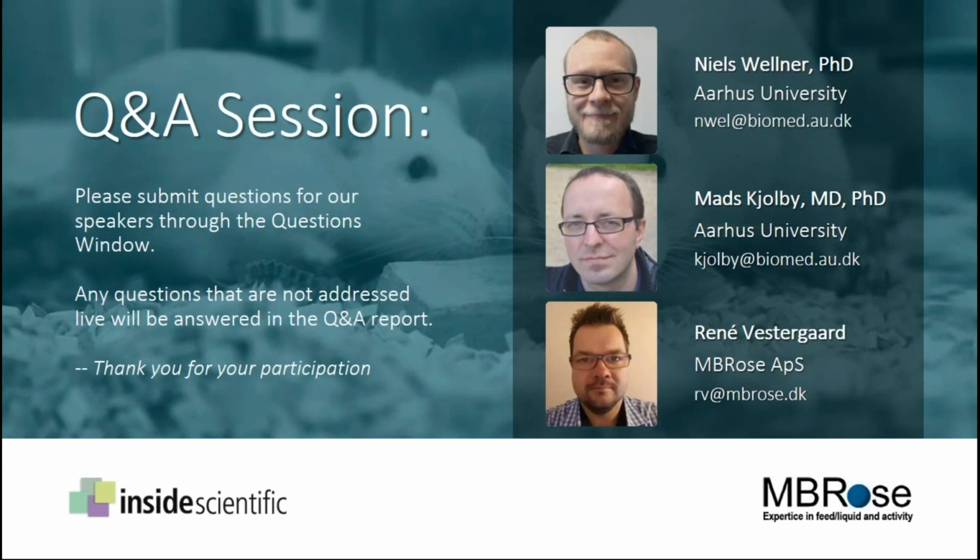Okay, very good. Eveline has asked, can you refill the food and drink dispensers without interrupting the session? Renee, I'll let you answer that question. Okay, yes, that's a very good question, and the answer is yes, you can, because the only thing you need to ensure is that there are no animals inside the channel. So what we recommend doing is closing the metal slider we talked about, so you close the channel off and make sure there are no animals inside. Then you can fill up the food hopper and change the water bottle. As long as there are no animals registered in the channel, you can do exactly this. Okay, fantastic.